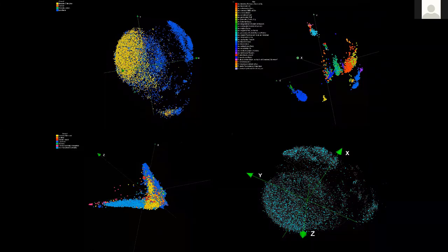And again, one of the things you can do, in terms of the selections and the choices you make in the tool, is that all of that information can be reflected back to applications like Germinate, in terms of how we actually link things together. Similarly with Flapjack, you can query information on the lines or the markers that you see within Flapjack, and Germinate can reflect that back for you. So we have a very lightweight but very functional way for our tools to actually talk to each other, and I'll mention a bit more about that later on in the talk.